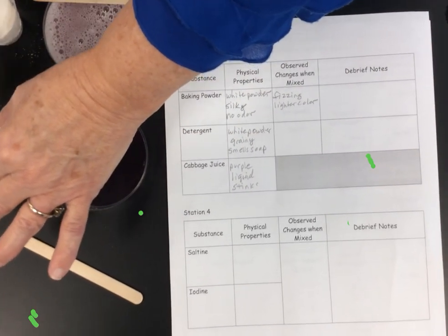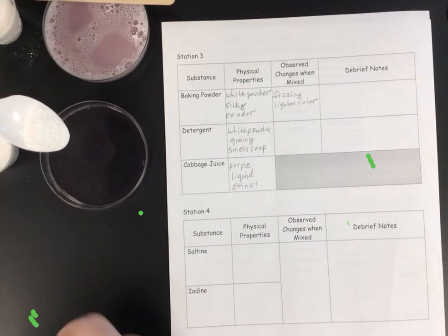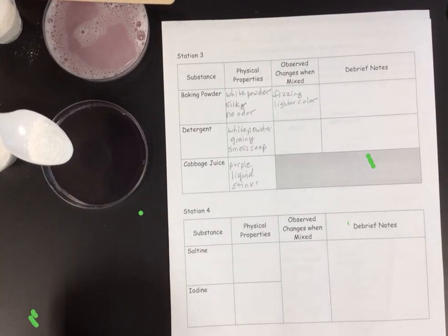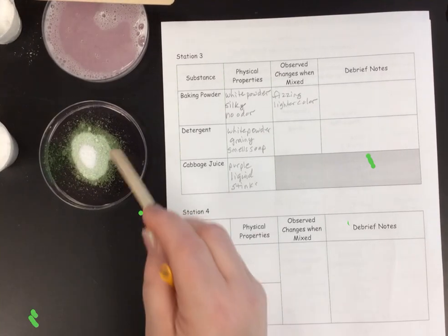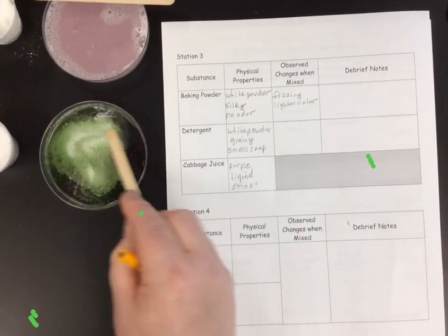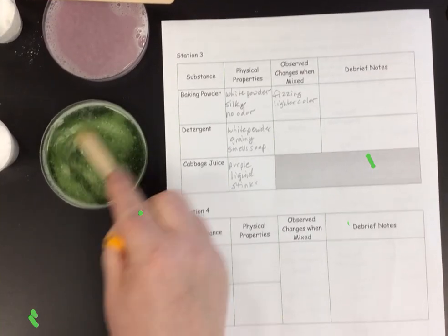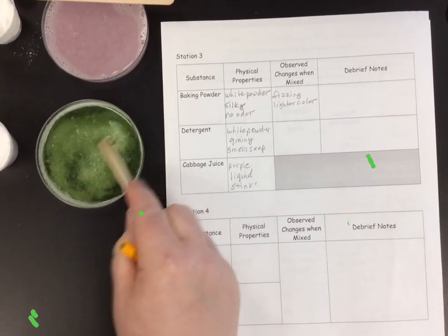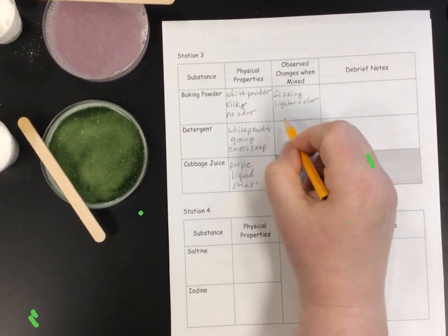Now we're going to do the detergent. Again, half a spoonful. This one you almost don't have to mix up. You're going to see it right away. Look at that. Wow. Wait a minute. It was purple. Now it's green? That's so cool. I did not expect that to turn green. Isn't that amazing?